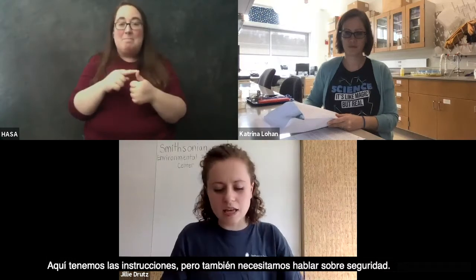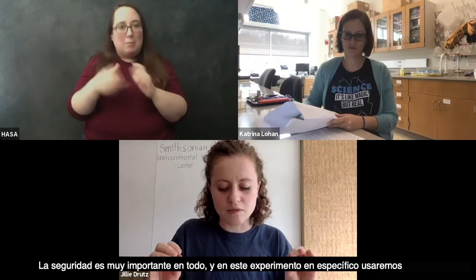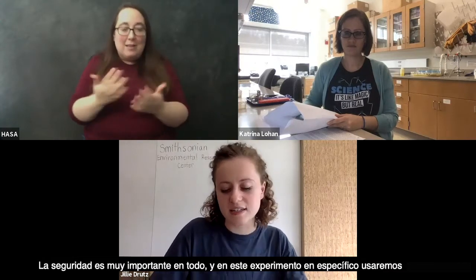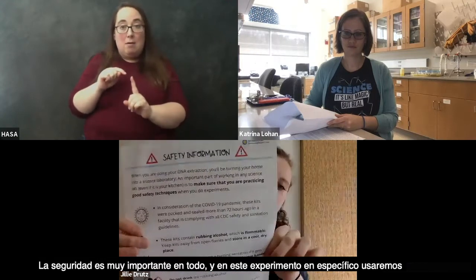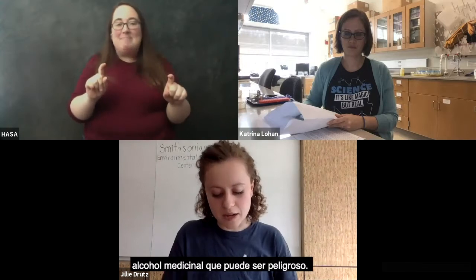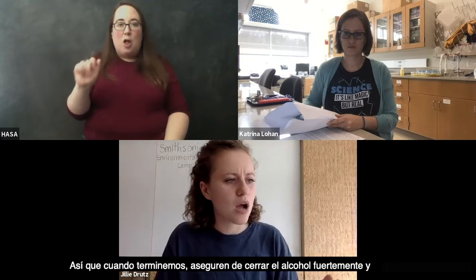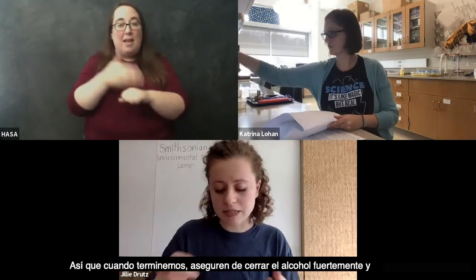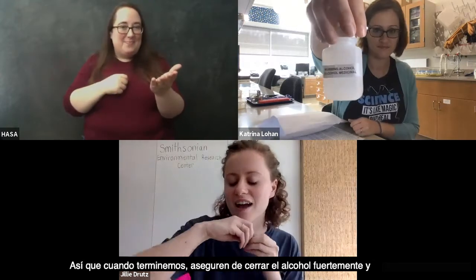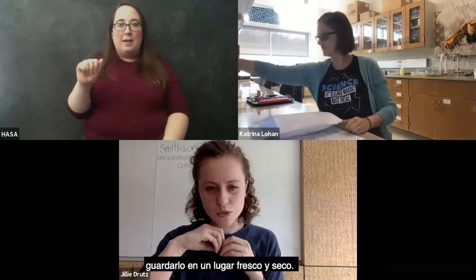And we also need to go over safety. Safety is very important with everything. So with this specific experiment, I'll pull up my safety sheet. We're going to be using rubbing alcohol, which can be dangerous. So after you're done, make sure you close the alcohol. Yeah, thank you, Katrina. There's our rubbing alcohol. Make sure you close it nice and tight and store it in a cool and dry place.